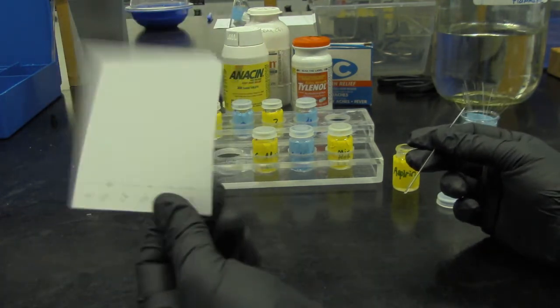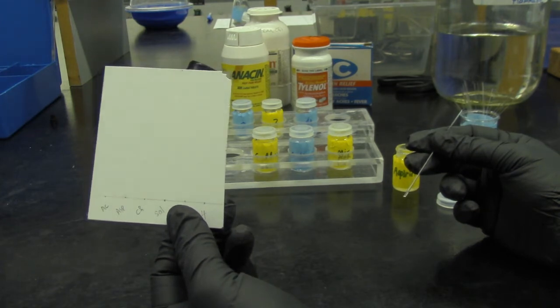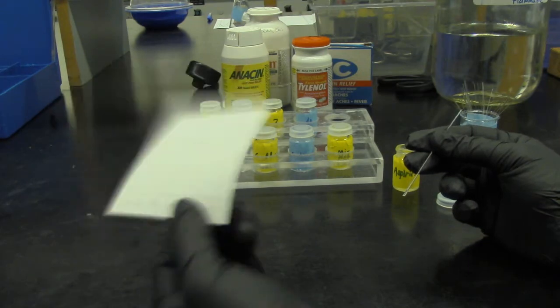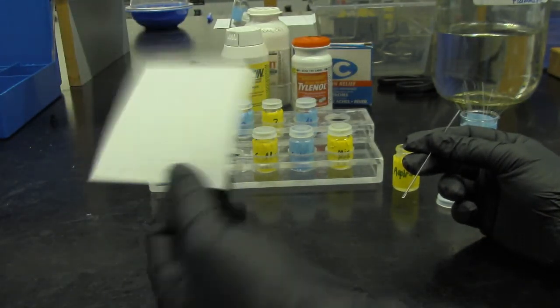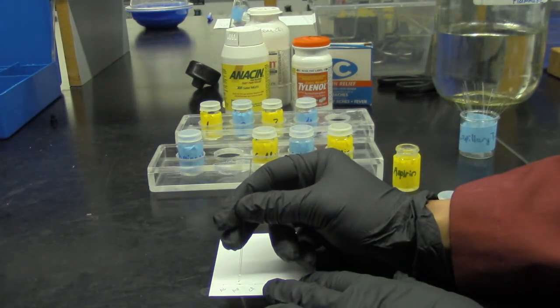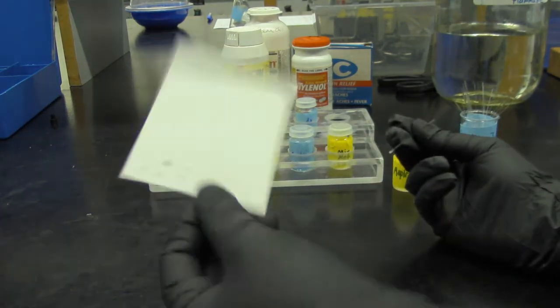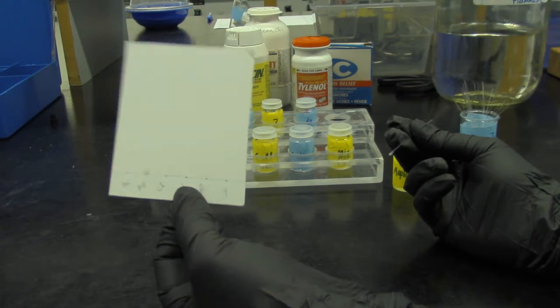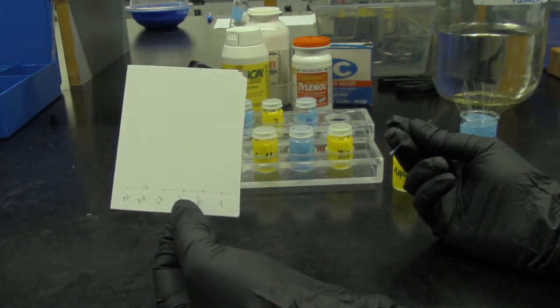So if you make the spots too big, then they're gonna overlap, right? Acetaminophen and caffeine and all the spots will be overlapping. You don't want that. So to prevent that, you spot it lightly and then dry it. And you spot it again. So the spots remain small in diameter, right? You want a small spot instead of a huge spot. Okay? You don't want the spots to be overlapping or touching each other. Okay?